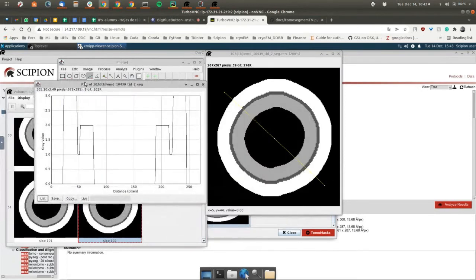by using the measuring functionality of the viewer. At least for this tutorial, I usually prefer that view because it is more precise when I'm trying to determine some sizes of the data and so on. I think it's quite a useful functionality of the XMIPP viewer.